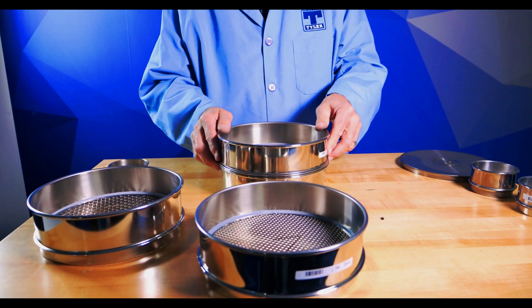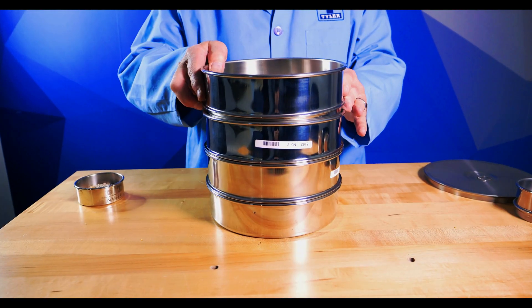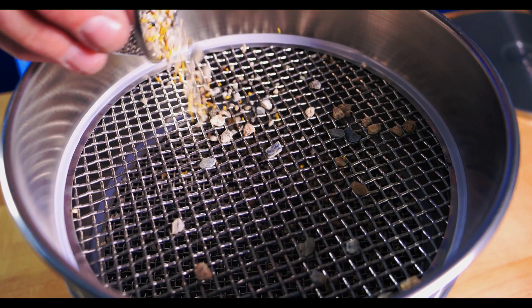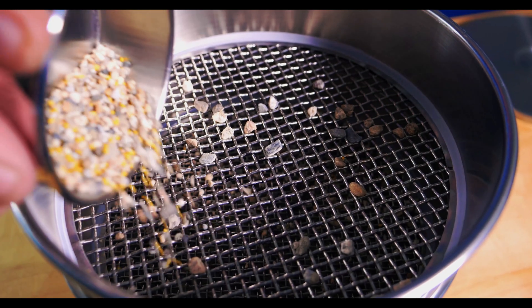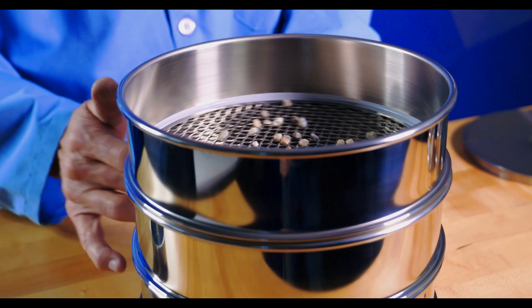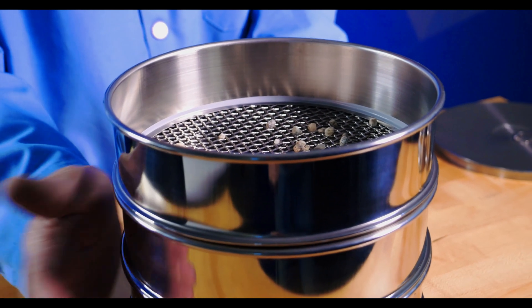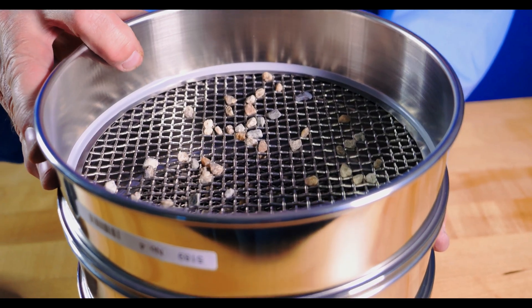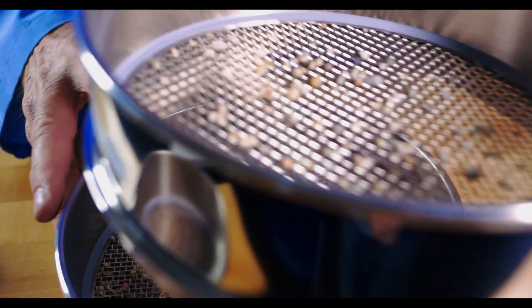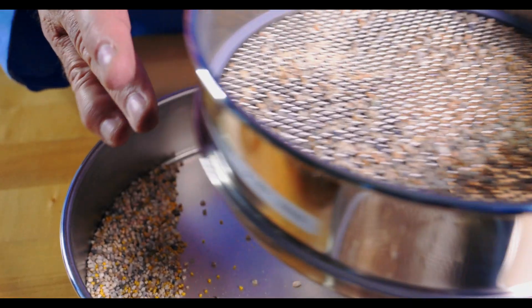If you have a stack of sieves required for your test, stack them with the coarsest sieve at the top and the finest sieve on the pan. Hand sieving a stack is most easily performed by placing the sieve stack on a table. You'll then want to rotate and gently tap the sieves for approximately three minutes. Each sieve should then be processed separately, adding any additional material that passes through to the sieve below it. This should be repeated until the finest sieve.